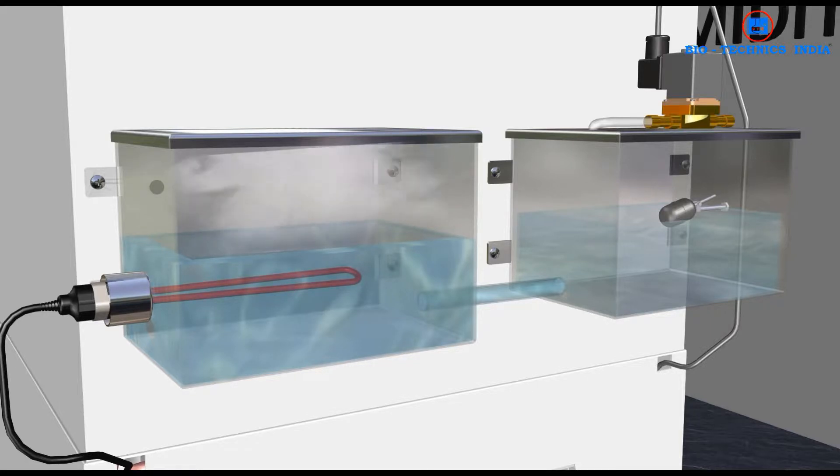Heater will turn on to convert the stored water into steam, which is used to humidify the chamber.